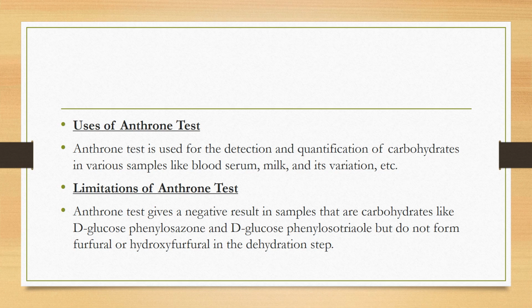Uses of the anthrone test. The anthrone test is used for the detection and quantification of carbohydrates in various samples, like blood, serum, milk, and its variations.